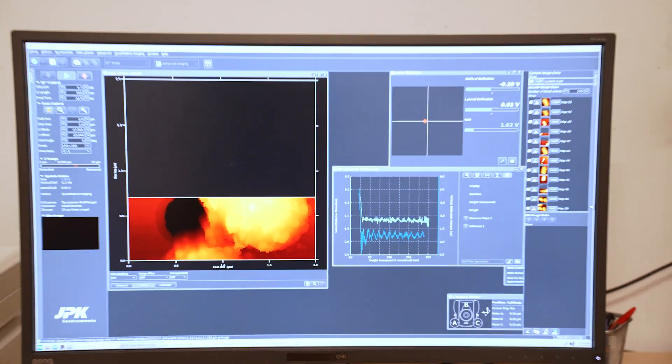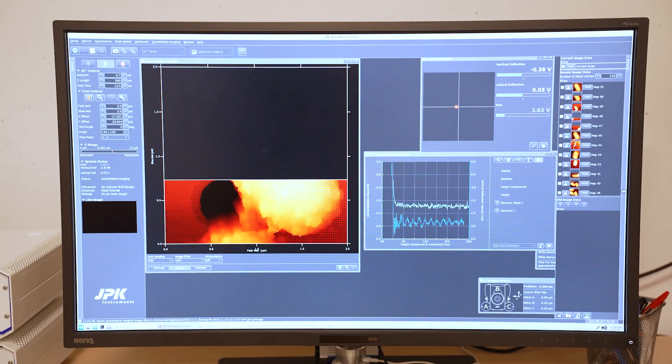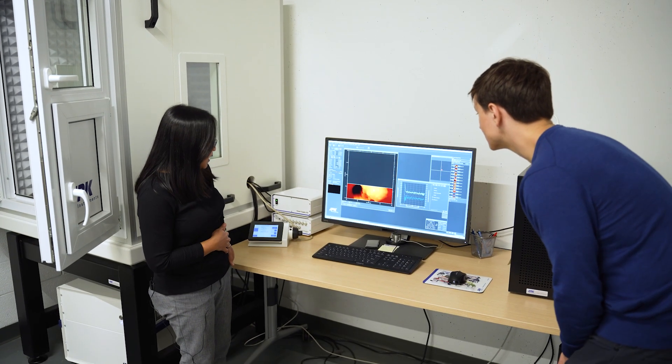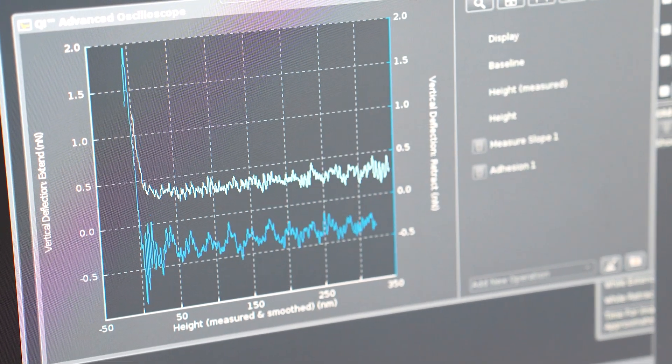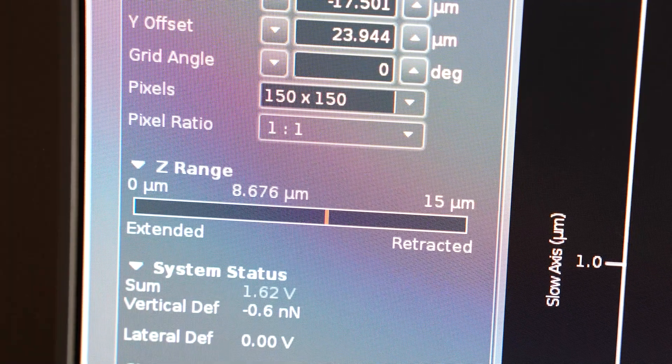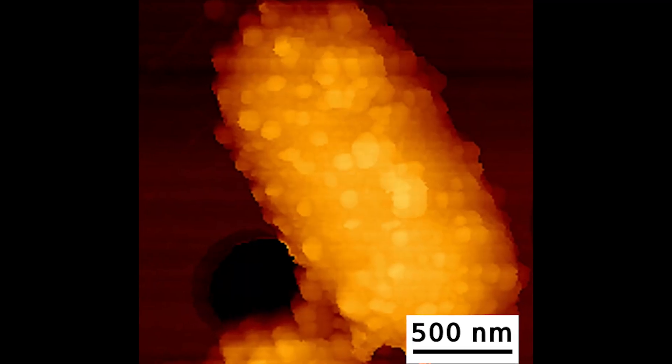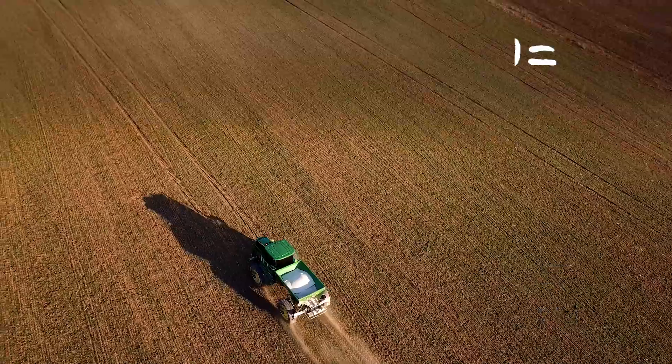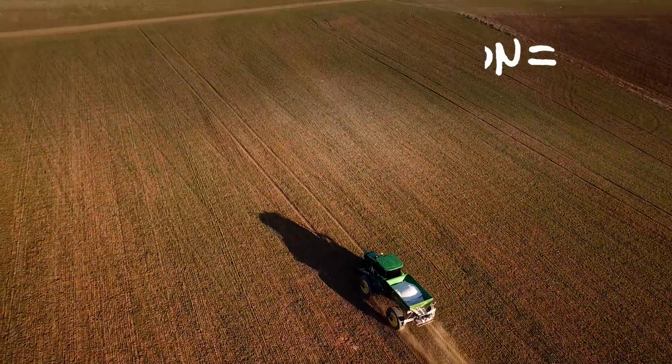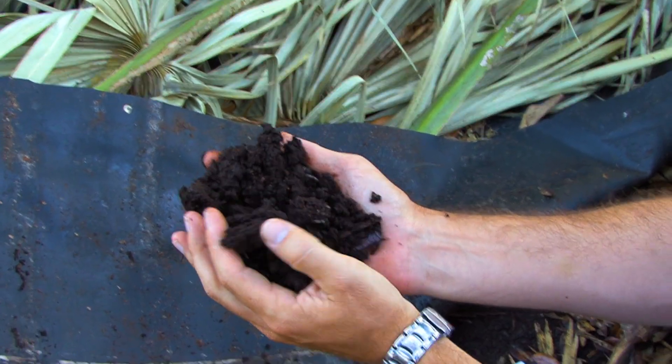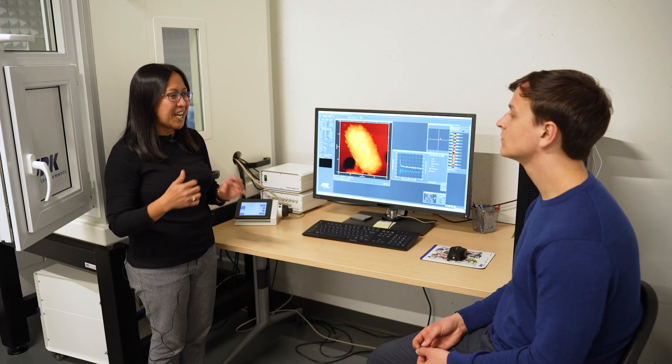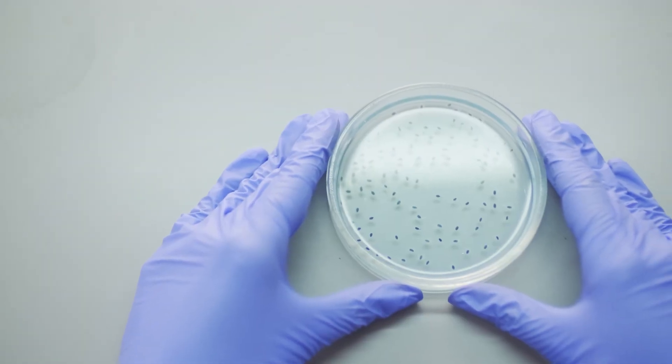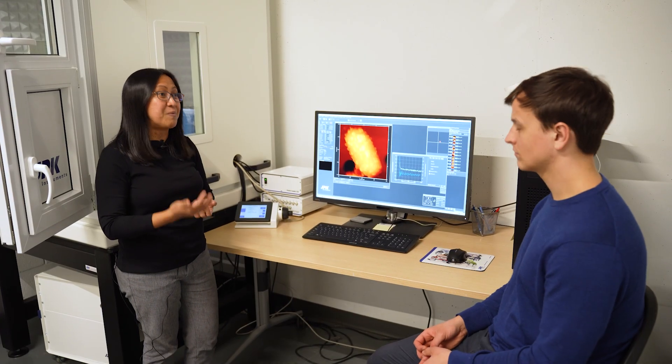So now, let's do an actual imaging of our nanoplastics on bacteria. And this will take about 7 minutes. So what are we looking at here right now? Is this the needle going across the same? Correct. Yeah. And it does so in a very systematic fashion. So we call it raster scanning. What motivated us to actually look into nanoplastics-bacteria interaction is there is currently a global shift toward the use of microbial biofertilizer. And for us to be able to design those microbial fertilizers more effectively, we've got to understand how is the soil environment impacting the chemistry and the biology of the bacteria that are inhabiting the soil. And what actually we are looking at is which of these bacteria are more resilient to the effect of nanoplastics. And those bacteria that are more resilient, I would say they are better candidates as microbial biofertilizers.